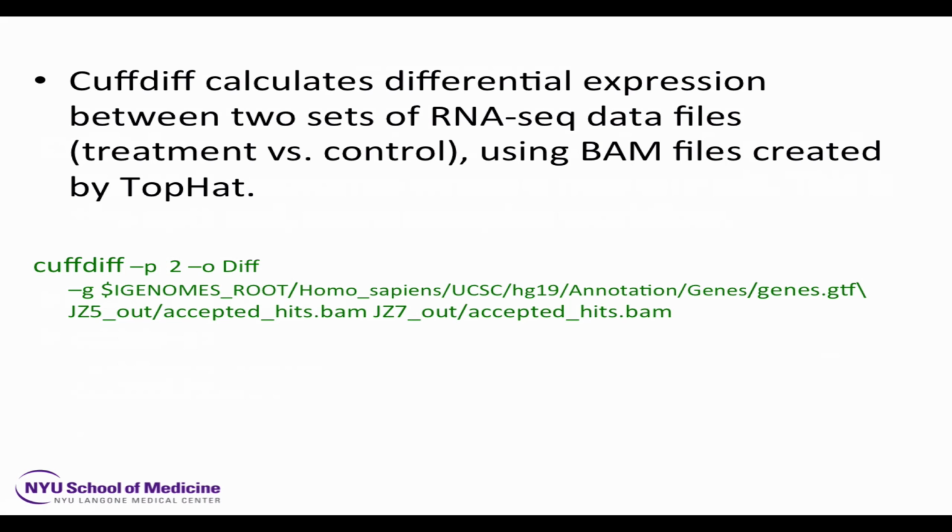It actually, in its output file, shows you the expression for each of the input samples as well as the differential expression, and it also runs a statistical test to do multi-testing correction for that differential measurement. This is very widely used. You'll see a lot of publications based on the results of this script.